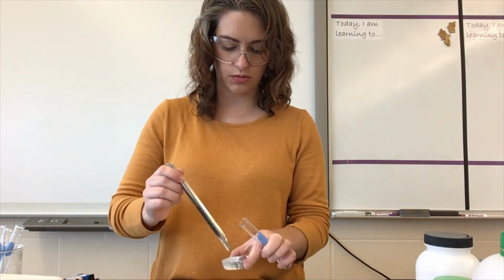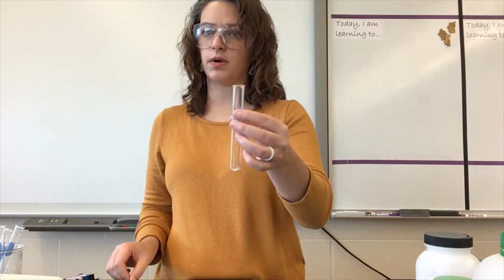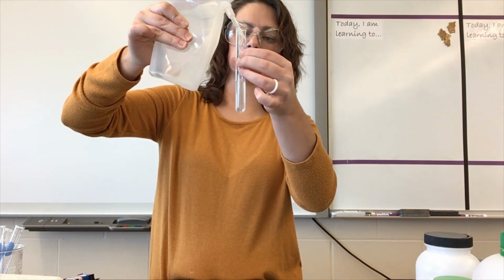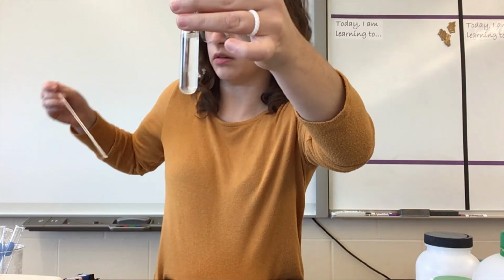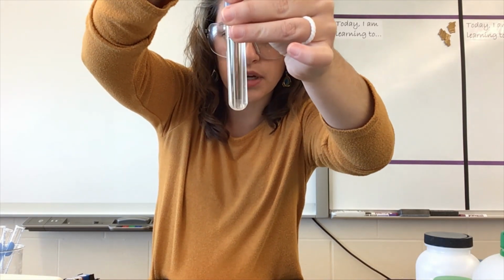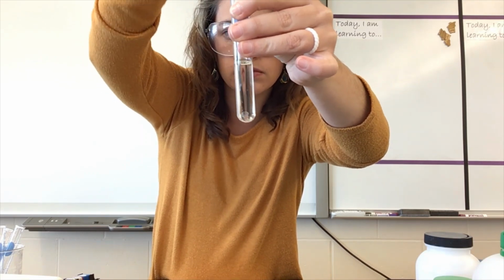Next up is solubility. So clean test tube. Grab a little bit of the sodium bicarb. Add some water. And that one, I don't even think I need my stir rod. I'll stir it anyway, just to be consistent, but it pretty much immediately dissolves. So sodium bicarbonate, definitely soluble.